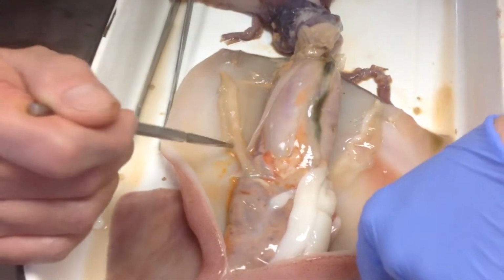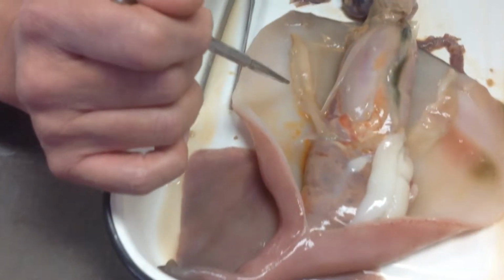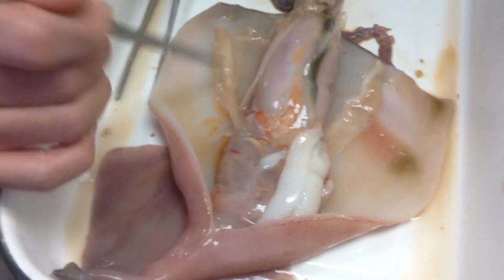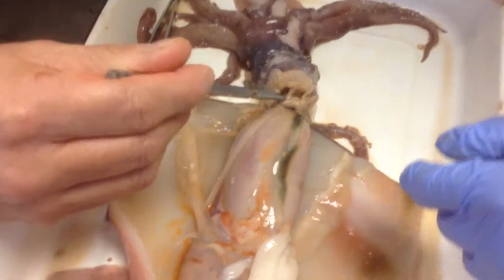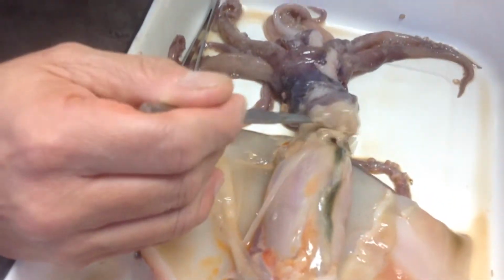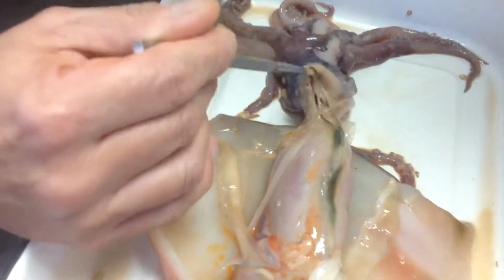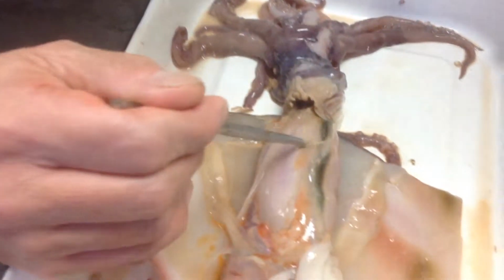I'm betting these are gills. I'm betting this here is a gill, and I'm betting that here's a gill. This wasn't a completely closed-off area, so that would make sense. I'm betting this is a gill. Was there a tube? Yeah, I noticed that earlier. Oh my God, it seems as if a hole is leading... It's damaged. Right? Yeah, it was damaged before we started.